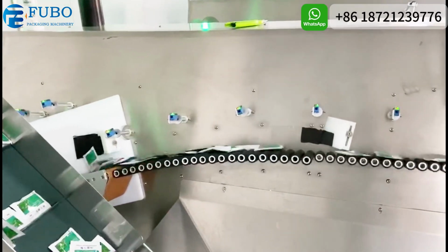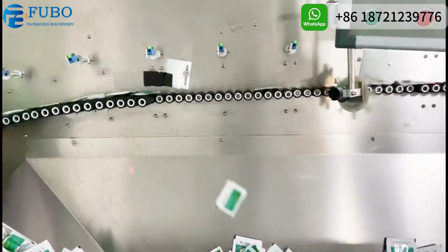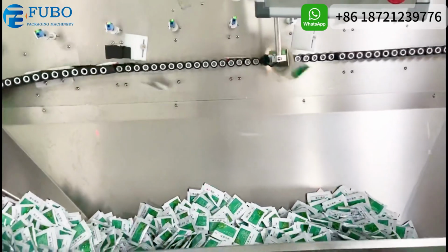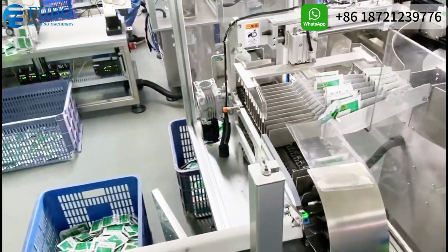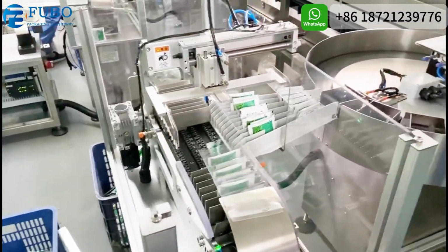The machine takes a disorganized pile of sachets and separates them, often using conveyor belts and rollers, to be oriented in a consistent manner, e.g. same side up, same direction.